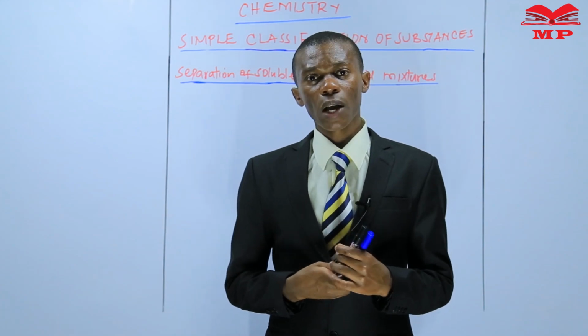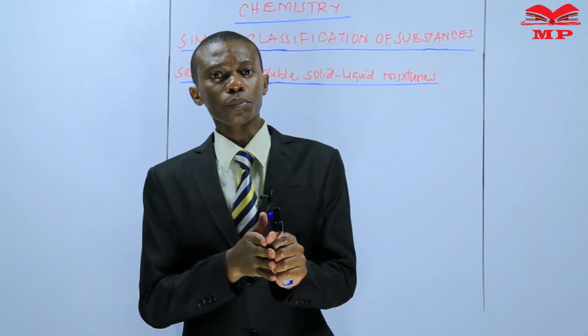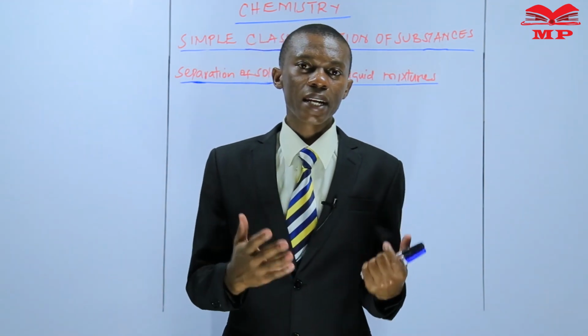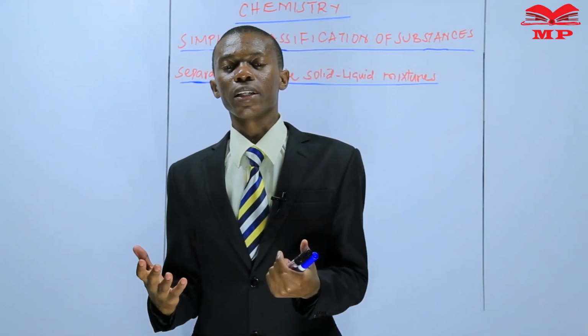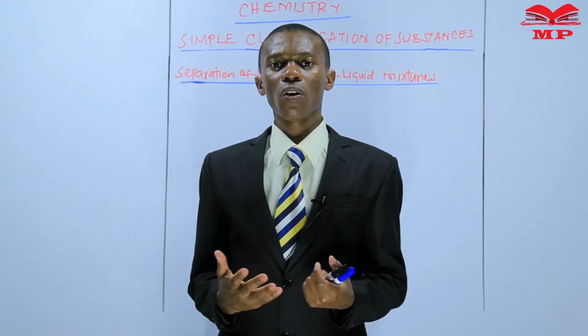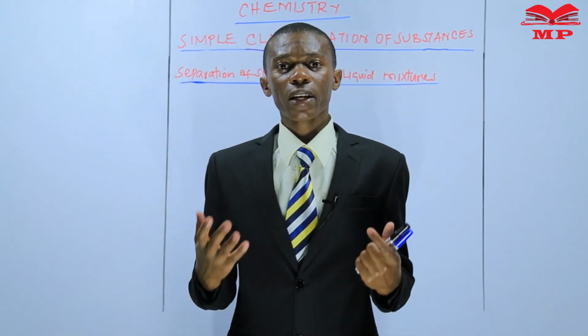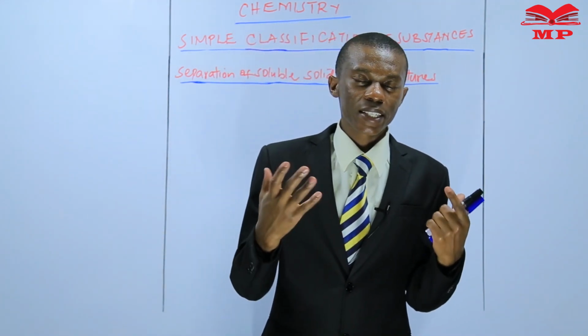In this lesson, I want us now to do a separation of sand and sodium chloride. How can a mixture of sand and sodium chloride be separated?